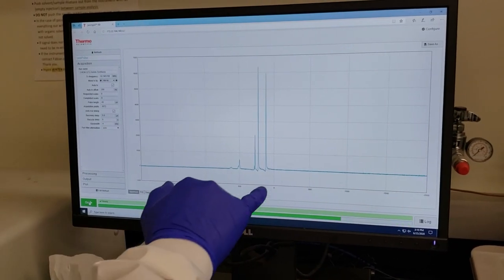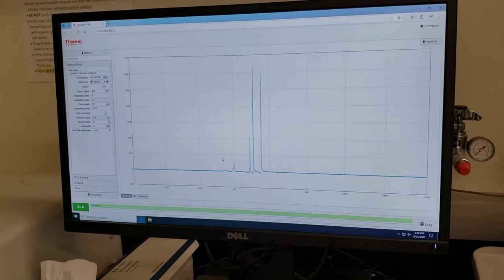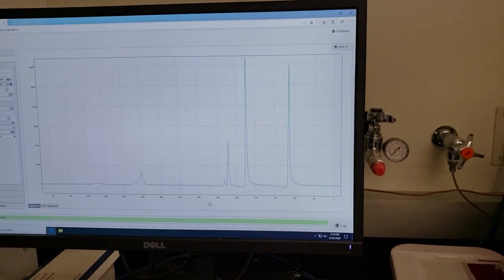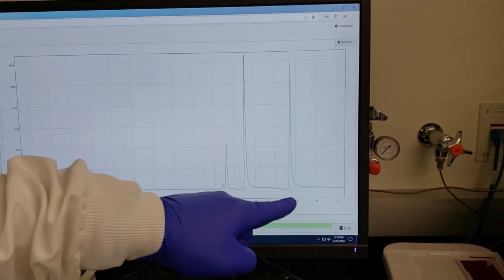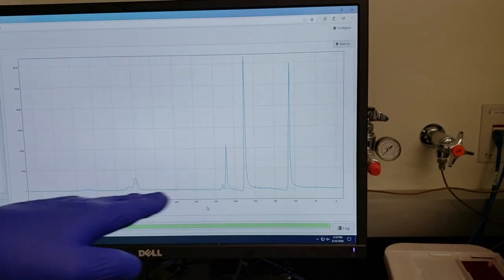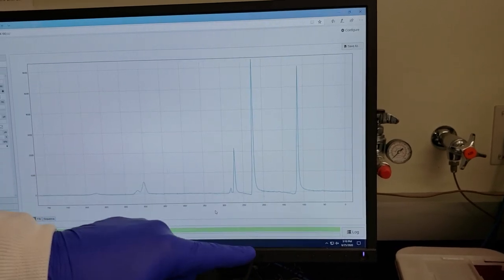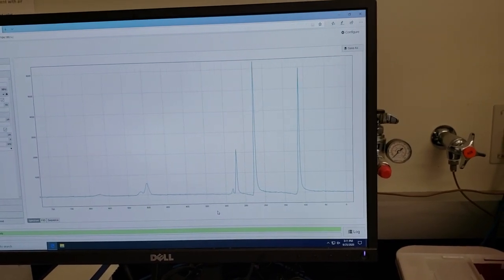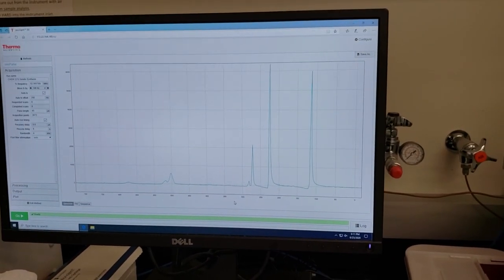And there we go. So we're a little bit off phase, but we're going to clean that up in our MNOVA software. Let's go ahead and zoom in, so we can get a sense of what our spectra looks like. So we're going to take this spectra, put it into MNOVA, and go through and assign. We see our TMS here. We've got a pretty significant TMS peak, so quite a lot comparatively speaking. We'll go through and integrate each one of these peaks. Once we get this set to 0, then our delta values will come in line. We'll post it up on ELC for you to go through and identify all of the important peaks for characterizing your unknown product. Good luck with your lab reports.